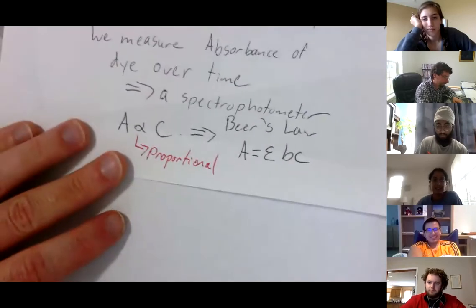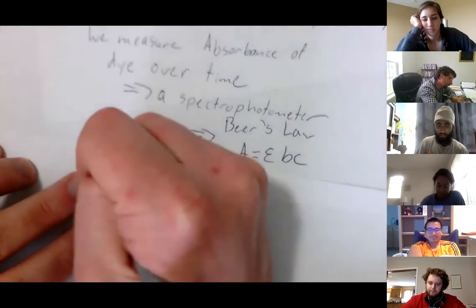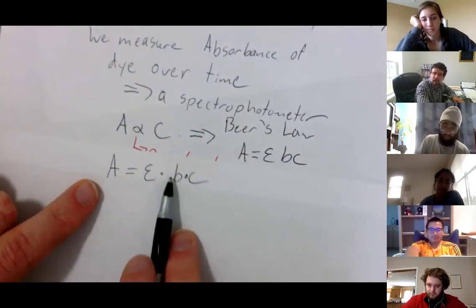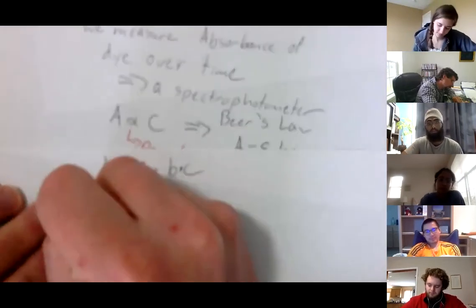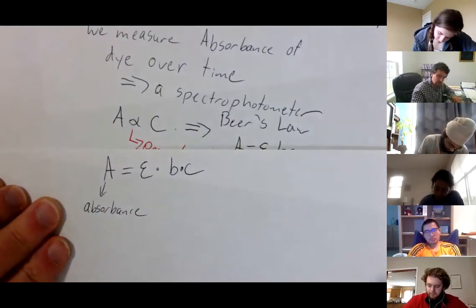There we go. Okay, let's talk about these things. Let's define what these terms are. What's A? Absorbance. Yep, this guy's absorbance. What's C?